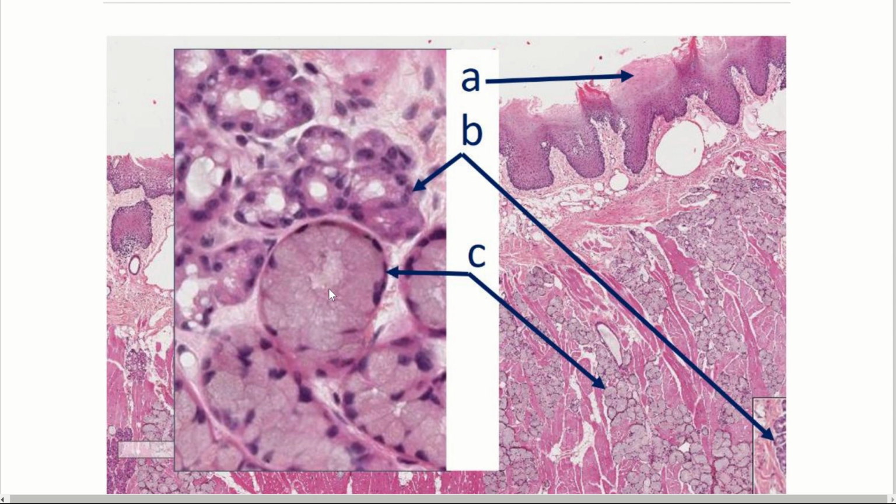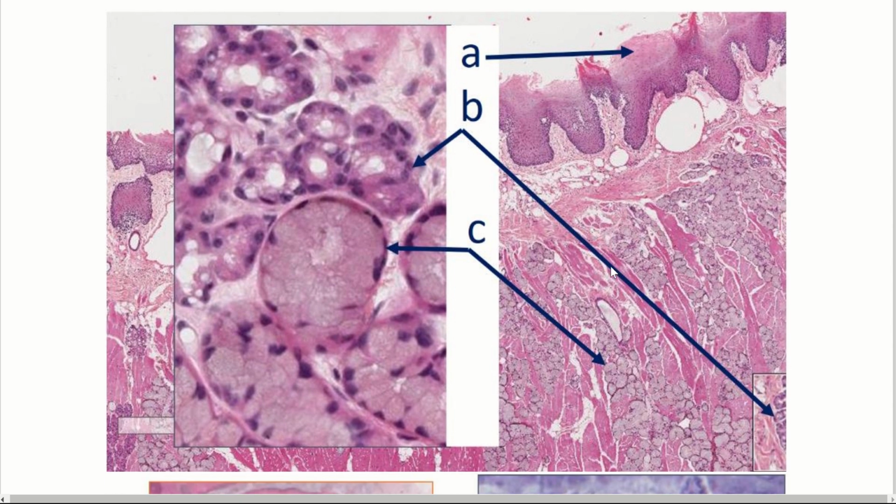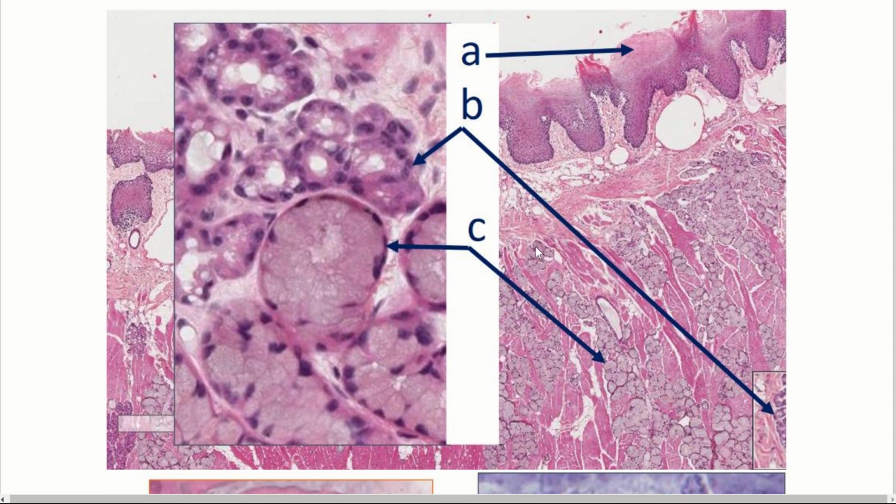I think they look more green somehow, a little more snot-like, and a little more bubbly and fat. So that's how I associate them with mucus, they look more mucusy, more snotty than our serous glands. So that's that one, just the different things of epithelium.